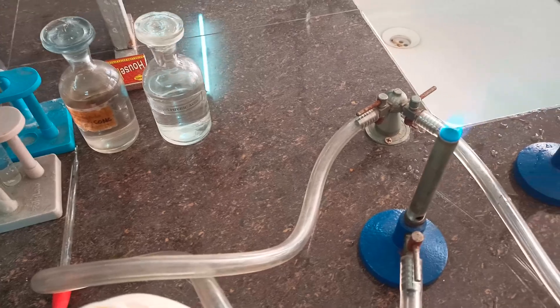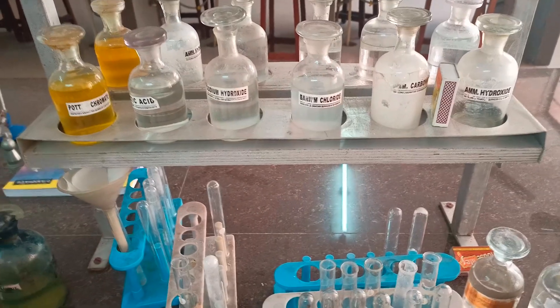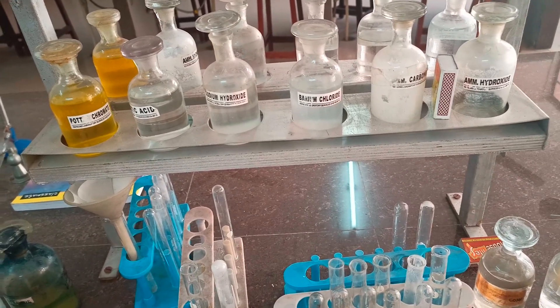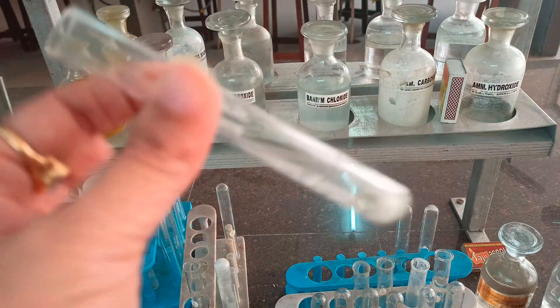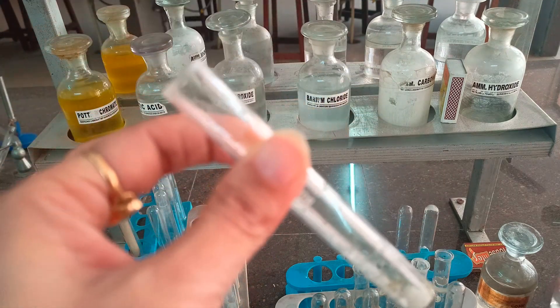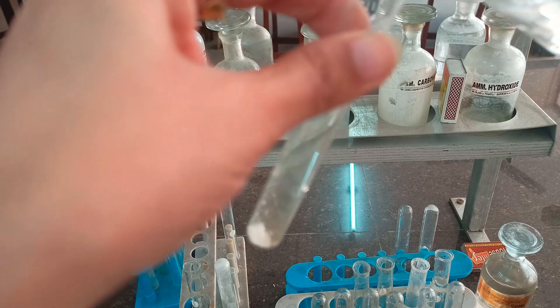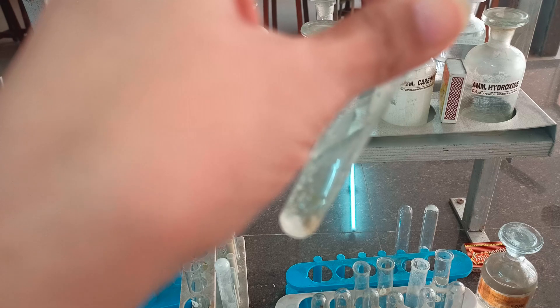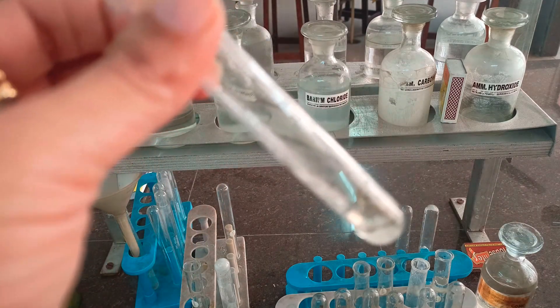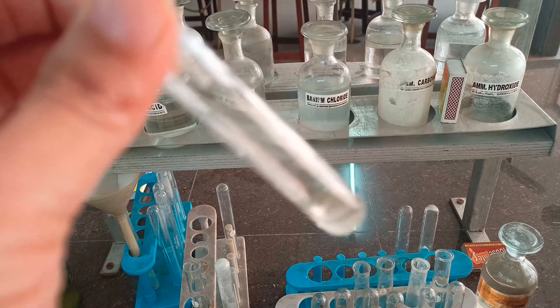After the preliminary test, the next step is to find out which acid or basic radical is present in our salt. For the dilute sulfuric acid test, I have taken a pinch of salt and added dilute sulfuric acid. Observe carefully — no gas is evolved, no bubbles. This means carbonate, sulfide, and nitrite are all absent.